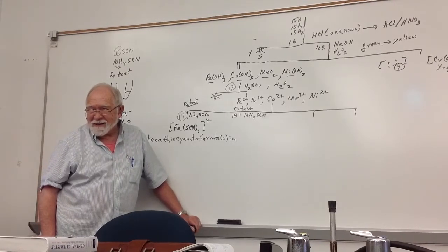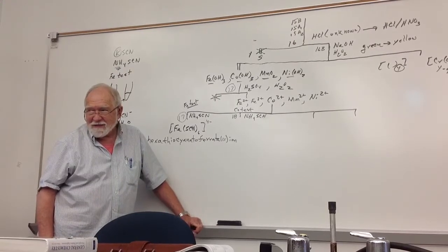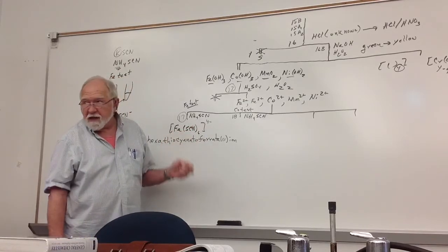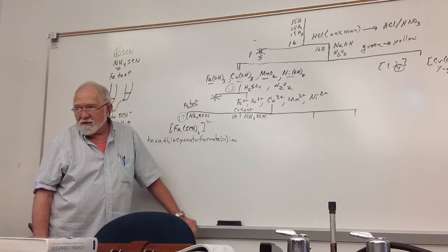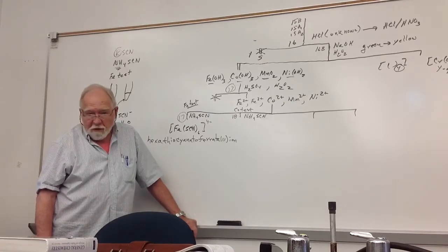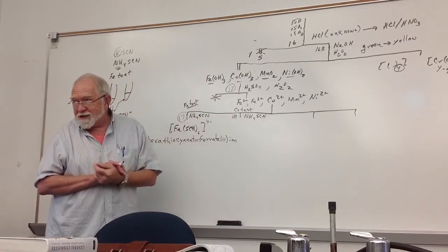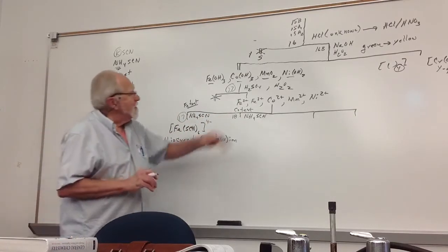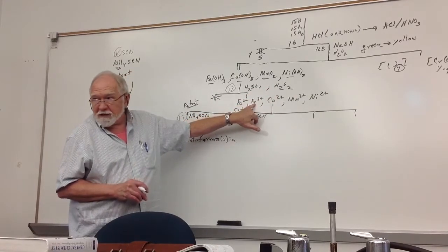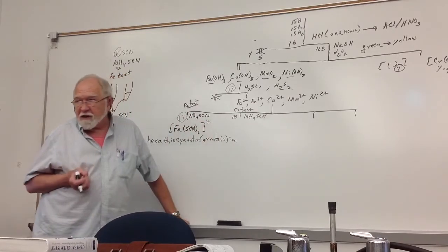Are we not, for the iron 3, is that not present at all? There's some of it that does form a complex just like this, except it's not as dark a color. But that iron is included in the group 3A, right? It's both. In other words, whenever you have iron 2, you're going to have iron 3. You can't avoid it. Even here, when you've reduced it, you'll get mostly this, but there'll be an appreciable amount of this. And I think the iron 2 is more intensely colored than the iron 3.